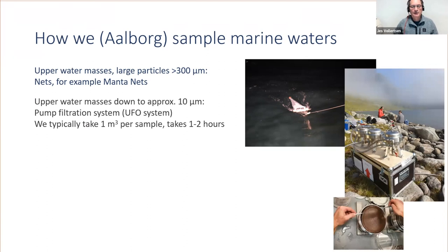You can also go into this in more detail using a pump filtration system, of which we have developed several. What you see here is a lake up on Lofoten, some Norwegian islands. And here we have filters, typically 10 micrometer filters in it. And then we maybe filter a cubic meter. And then you have the filters down here. And on these filters, we have some material. And this material we then analyze for plastics.